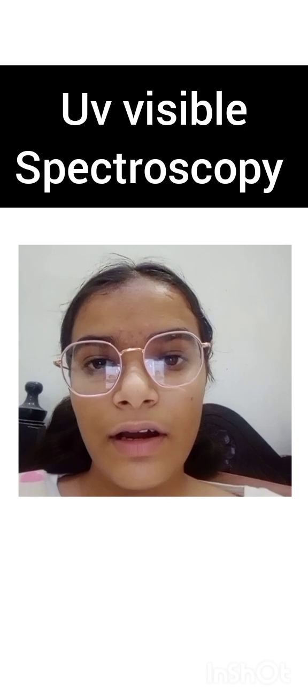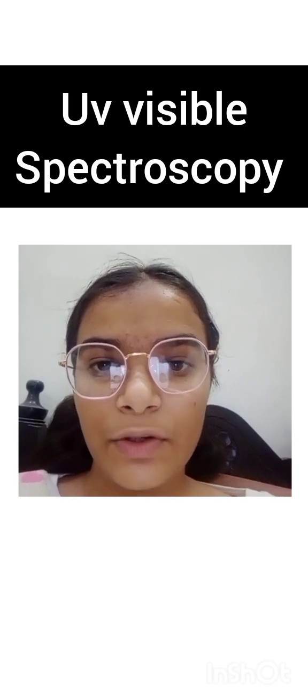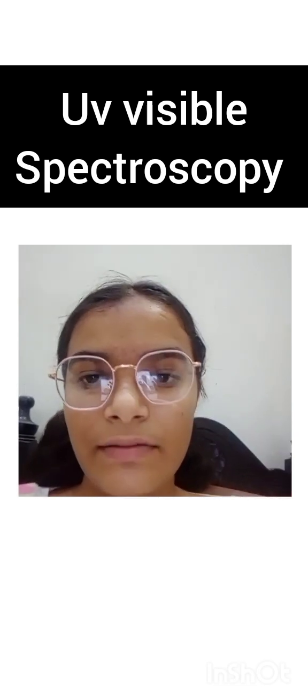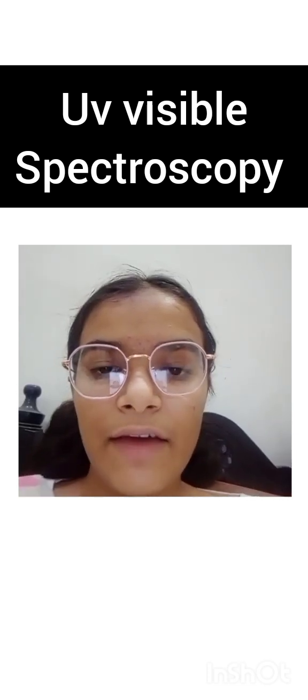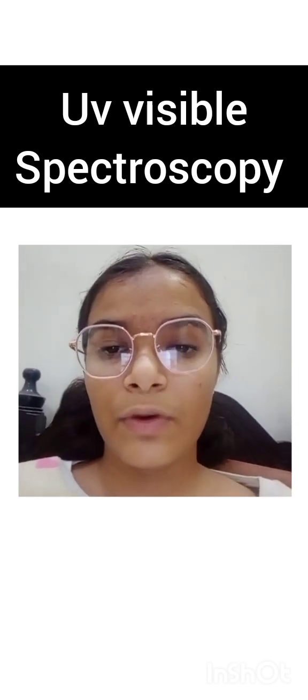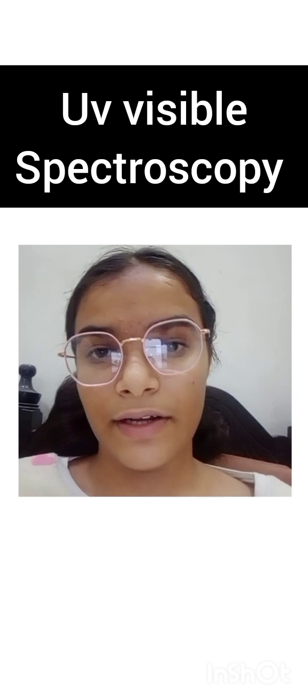In general, substituent may have any of four effects on chromophore: bathochromic effect, red effect, hypsochromic effect, hyperchromic effect, hypochromic effect.